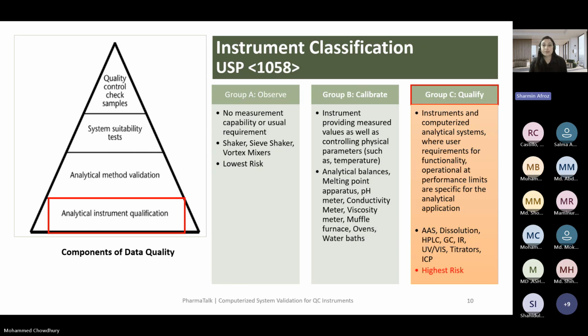For the analytical balance, it is operation qualification and the daily accuracy check. But for pH and conductivity, it is performance based, like the PQ. You are challenging the pH meter with pH 4, 7, 10, or 12, or 1, and it is performance based, whether your pH reading is okay or not. So a daily performance check is okay for it. You can go through USP chapter 1058 and the pH section, so you can clearly identify that it will be sufficient for the pH and conductivity meter.